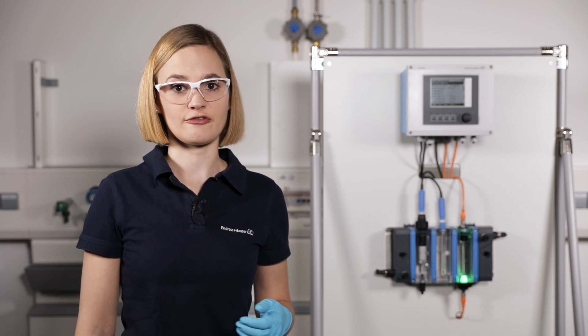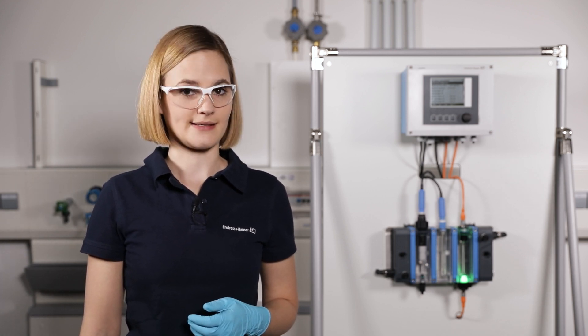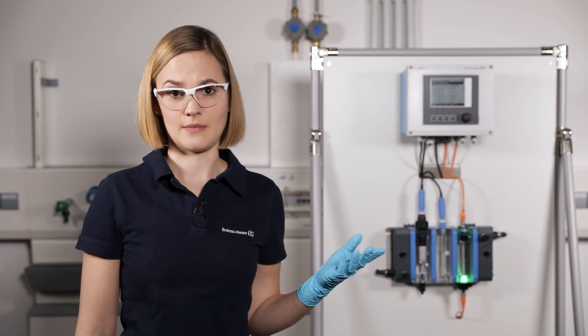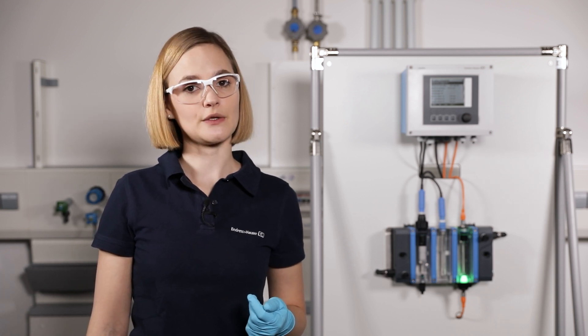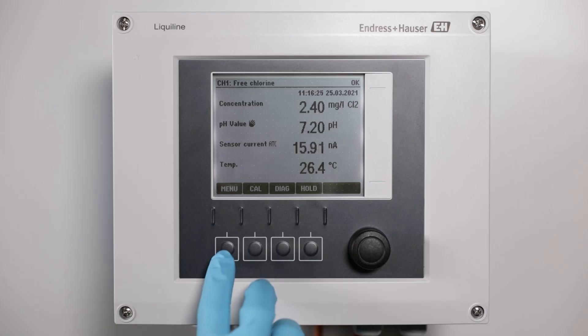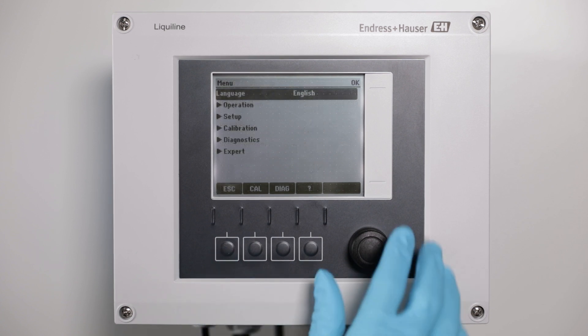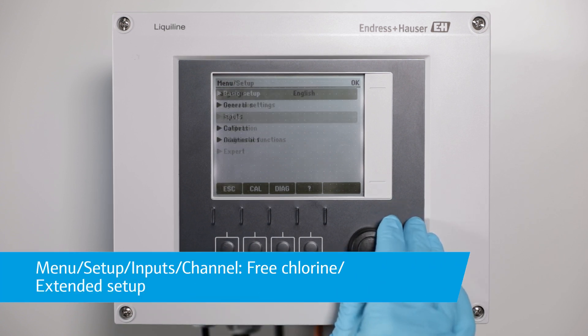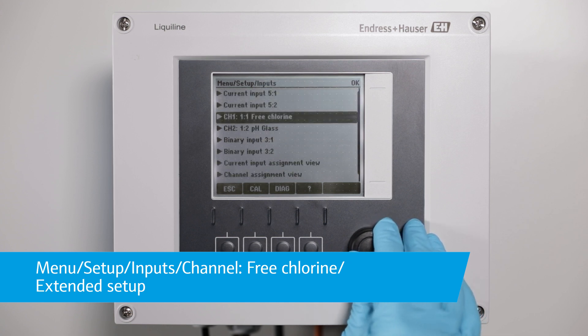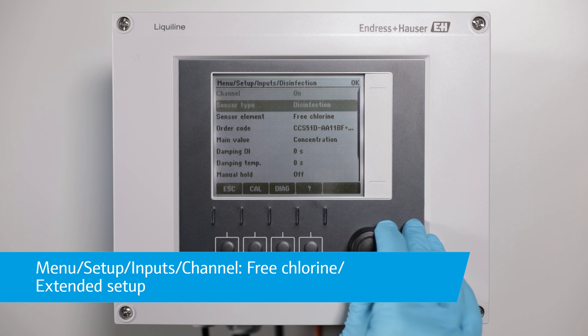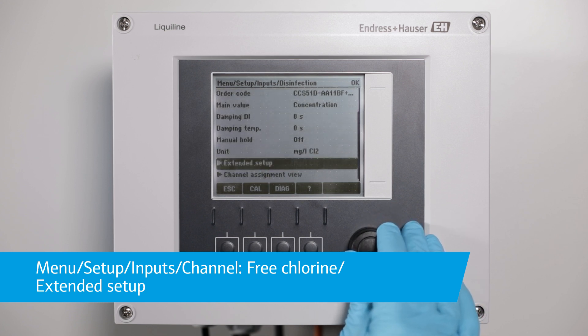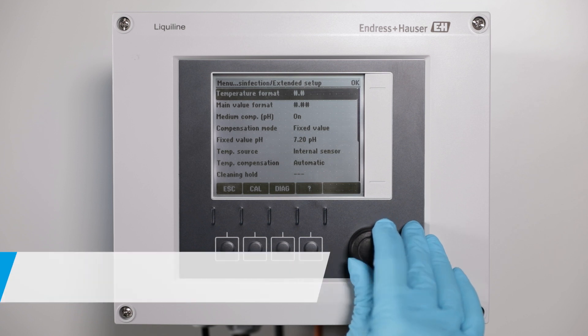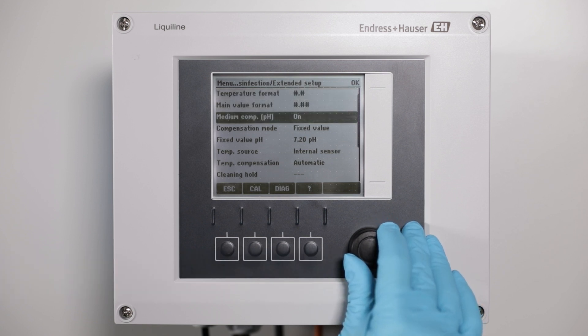A most important setting for free chlorine measurements is the pH compensation. In case a pH compensation is required, which is in the majority of the free chlorine applications, don't miss to set it up in the liquid line menu. To assign the measured pH value for compensation, go to Menu Setup Inputs and select the input of the disinfection sensor CCS51D. Afterwards go to Extended Setup and scroll down to Medium Compensation pH.